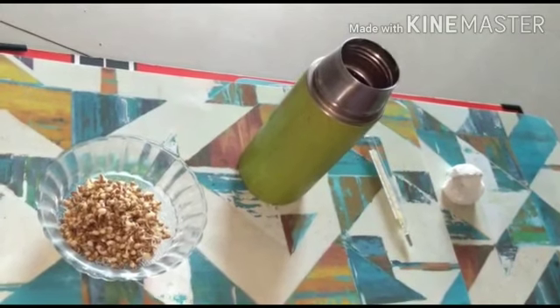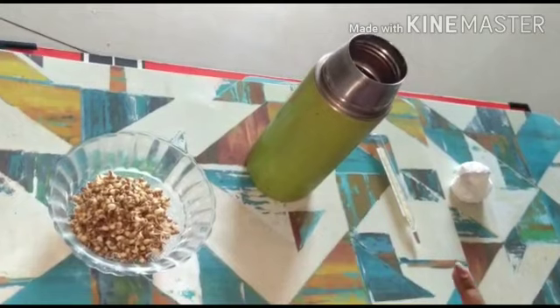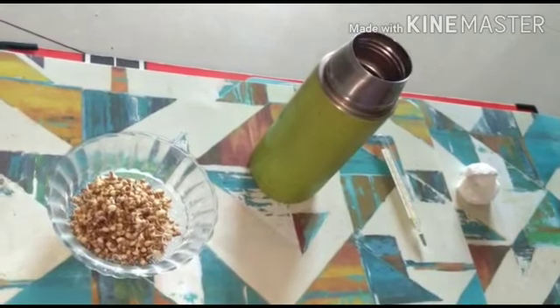Materials required: germinating seeds, thermos flask, thermometer, and a cork which is prepared from thermocol.